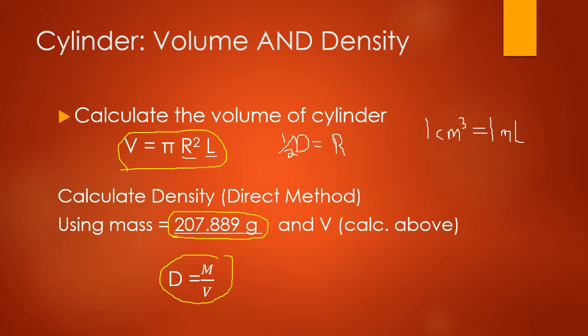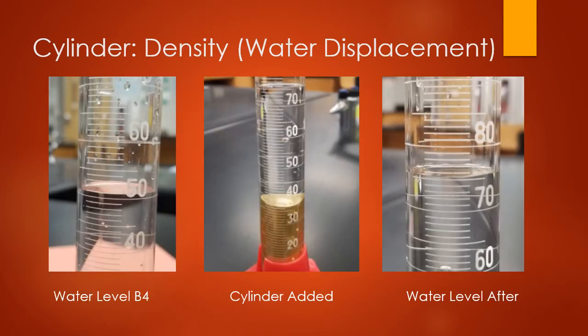Make sure to show your calculations and use the appropriate significant figures. The next part is determining the density of a metal bar by water displacement using a graduated cylinder. We'll use that same cylinder we just measured. We start with a 100 milliliter graduated cylinder and record the water level before adding the cylinder. I added approximately 50 milliliters, but I want you to tell me exactly how many you see — remember, go one past what the device allows.